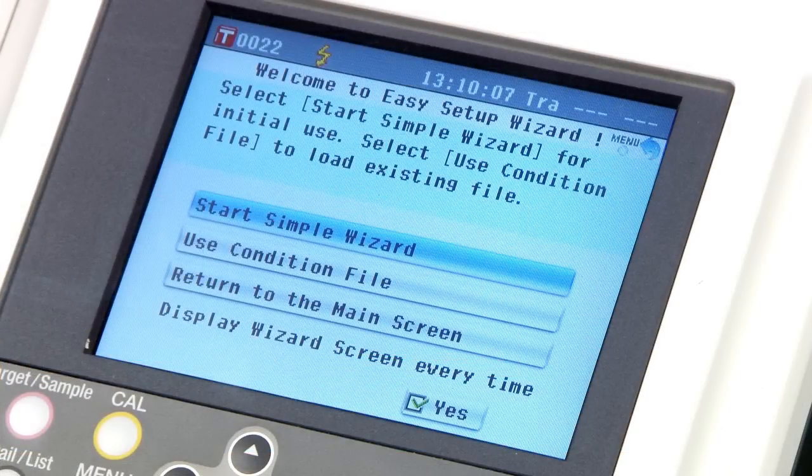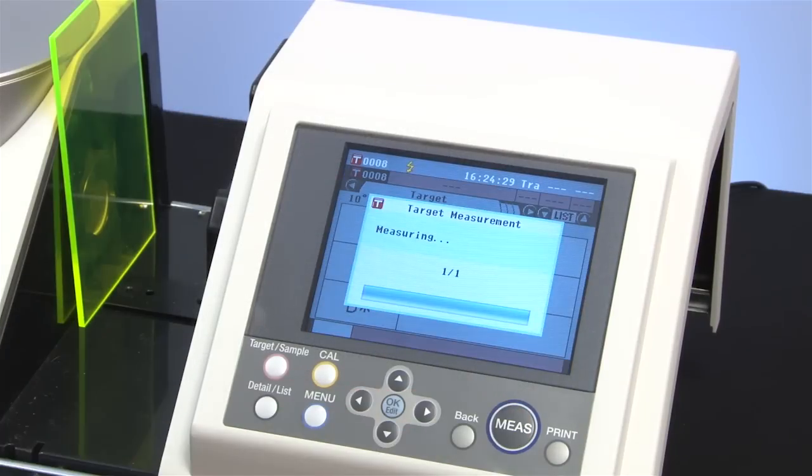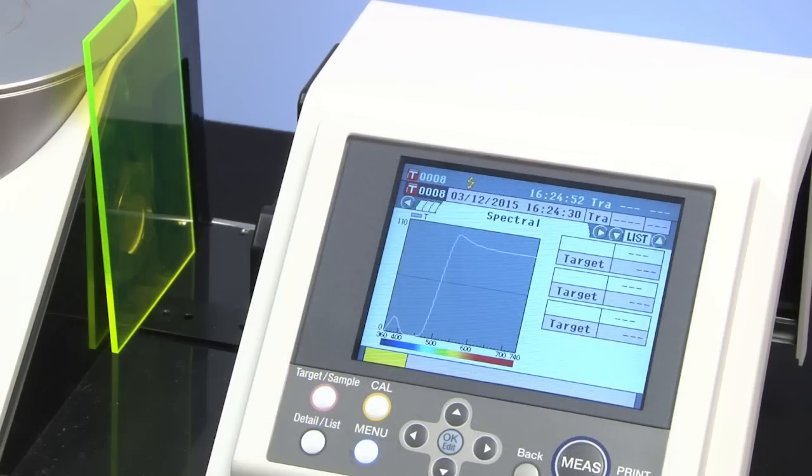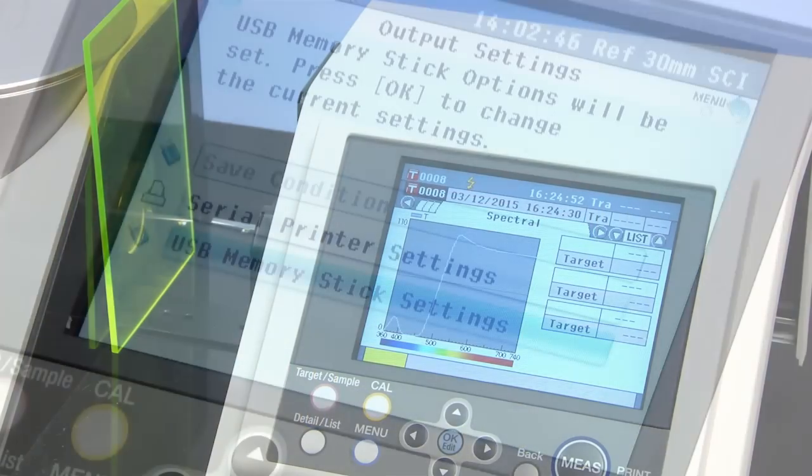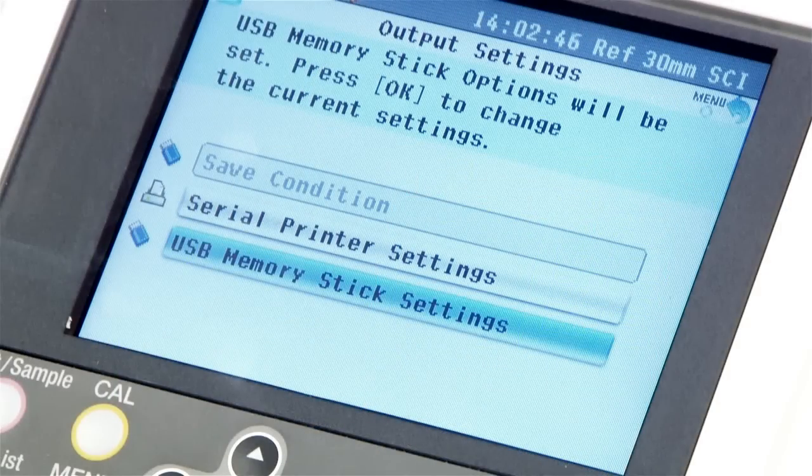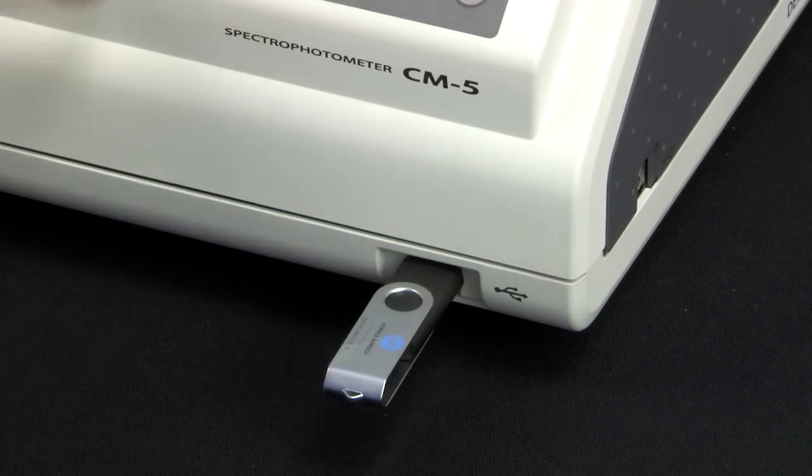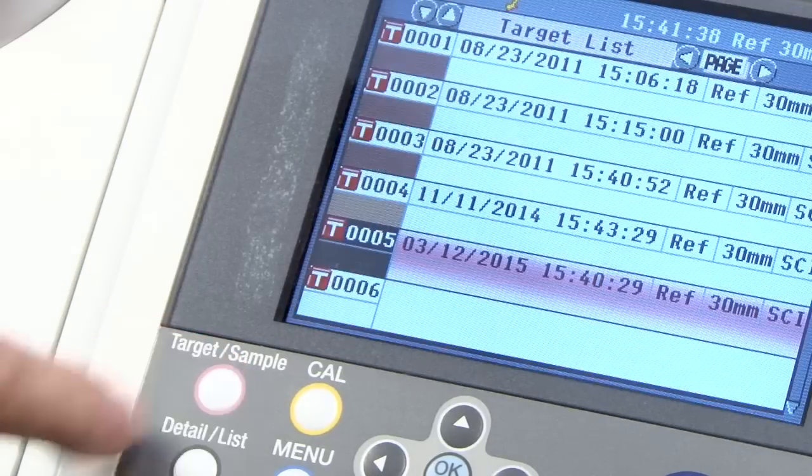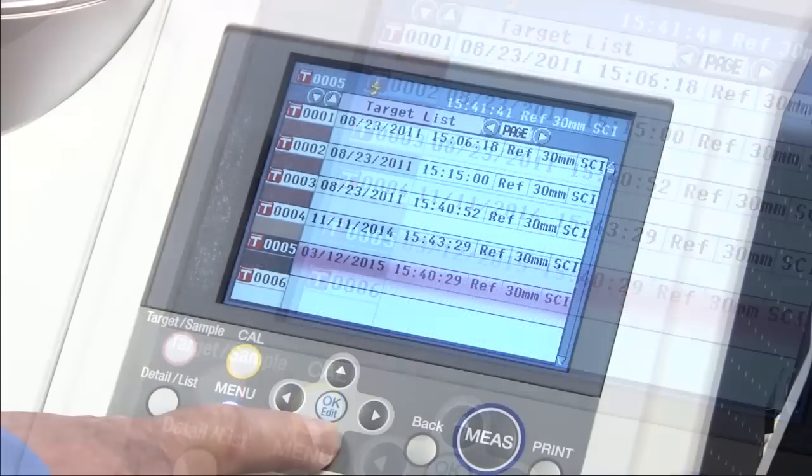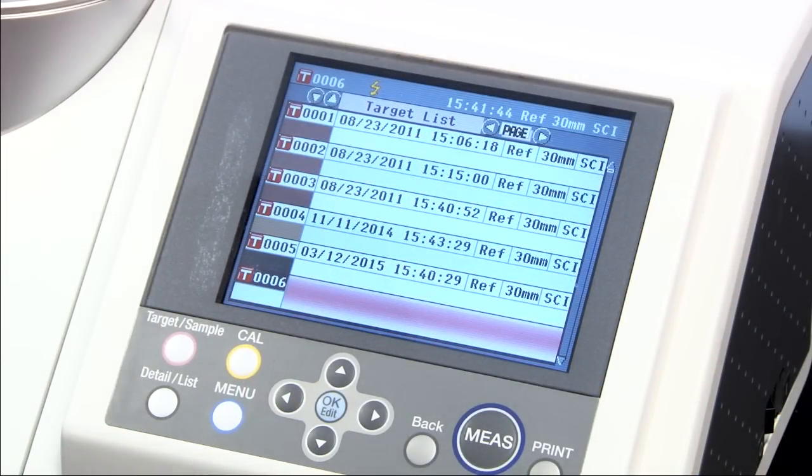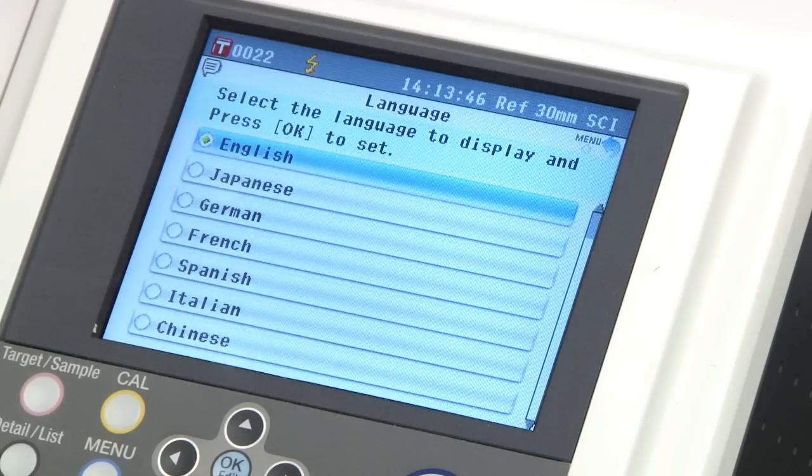With an easy-to-use wizard mode, measurements are performed by everyday users or occasional users alike. Stored data can be saved to a USB drive, making it easy to switch users and save settings without going through manual setup each time. In addition to the USB feature, the CM5 can store 4000 measurements and 1000 target colors in its large memory. You can even switch language settings.